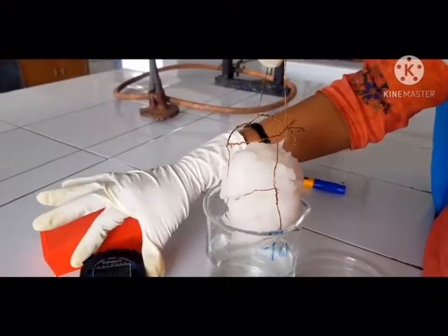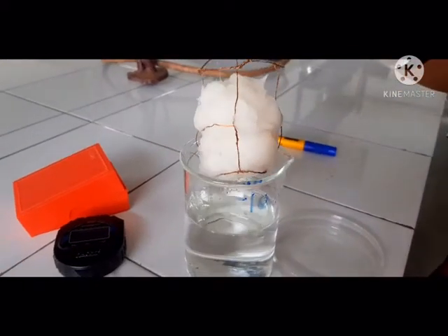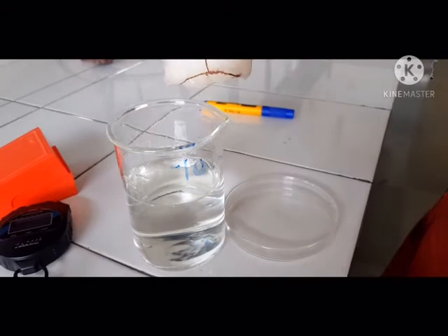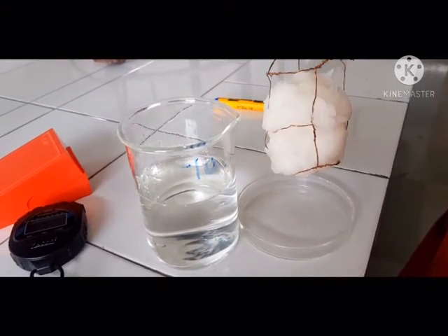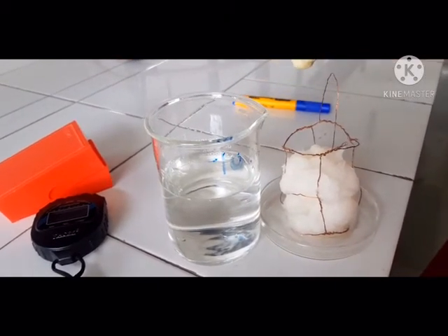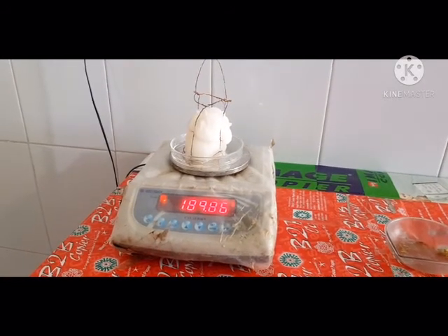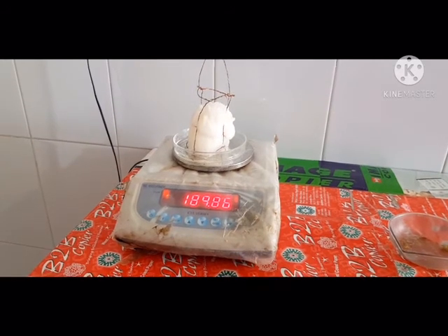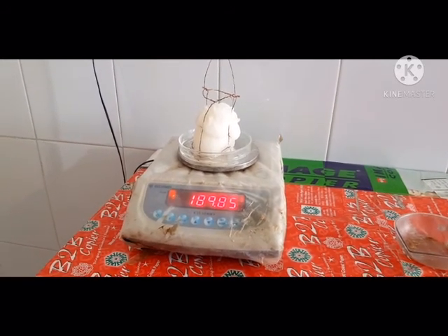Take the basket and transfer it to a tared porcelain petri dish which is already wet, and weigh it. The weight of the sinking time basket along with cotton is 189.85 grams.